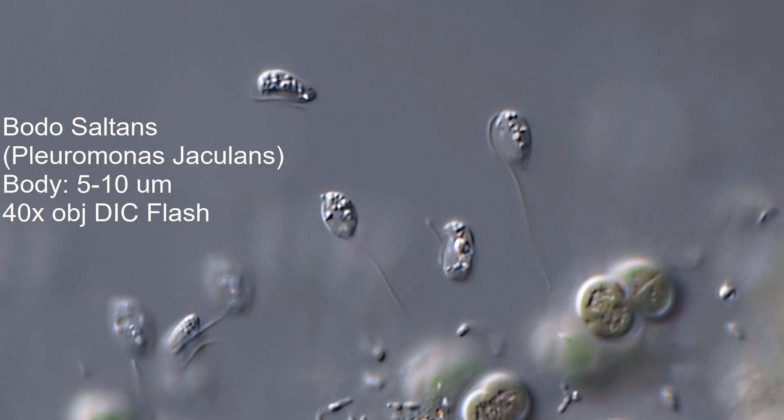So I'll do a few flash pictures. It's really frustrating to get these guys in flash because they just are in and out of focus at lightning speed. I have to take a lot of flash pictures, but here's a 40 power objective with DIC, and you can see the one on the right — you can see both flagella.